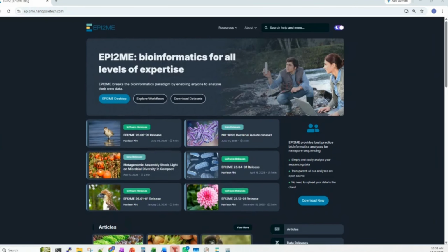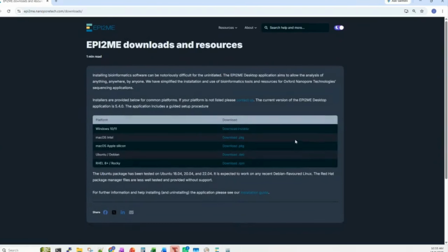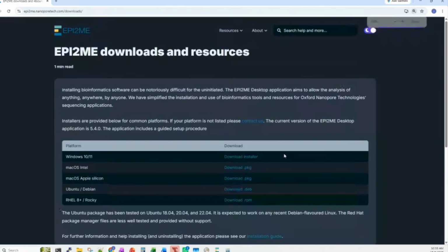When you are on this page, you will see some latest updates regarding EPI2ME. Over here, you can see the download button. Just click on it, and you will come to this page where you can get the EPI2ME installer. Depending on the computer you are using, if you are using Windows, this is the installer you should get.